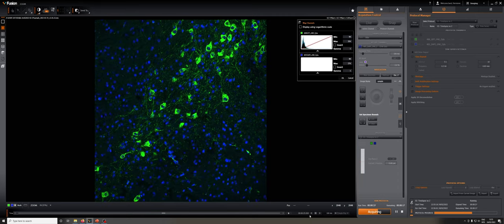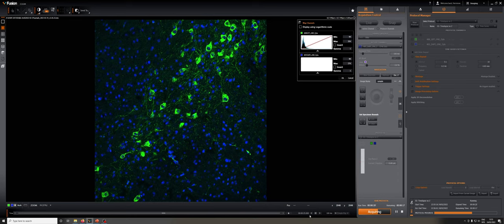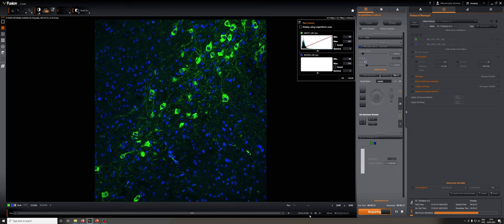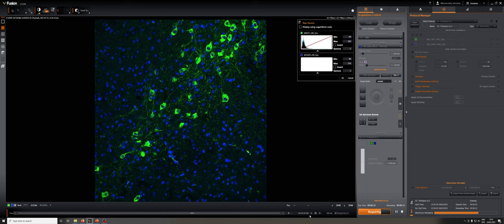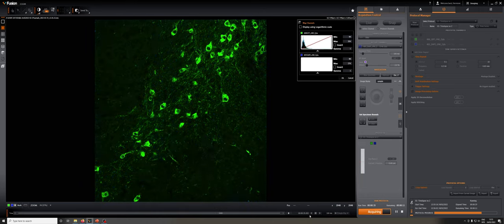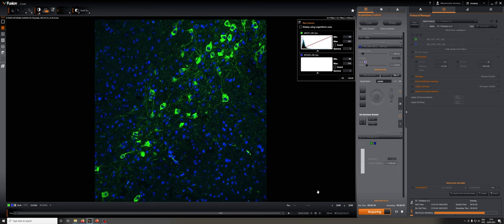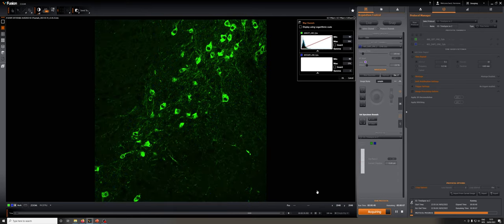Something important to keep in mind, particularly when doing time-lapse experiments with live samples, is that those samples can drift in their z positions due to small fluctuations in temperature. So this microscope has an option that can help with this called drift stabilization.